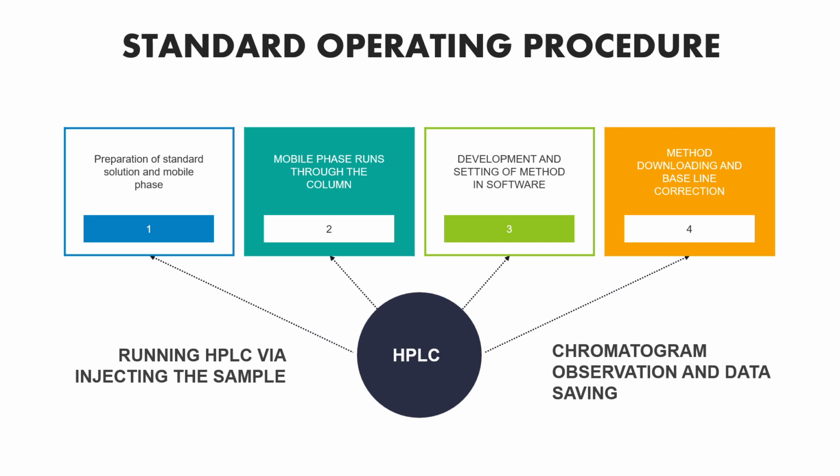The analyte will be observed as a chromatogram using the software, and save it. After completion of the work, perform column washing for 30 minutes. Allow the mobile phase to purge for 5 minutes. Then close the software, and afterwards switch off the HPLC instrument and the CPU. Thank you.